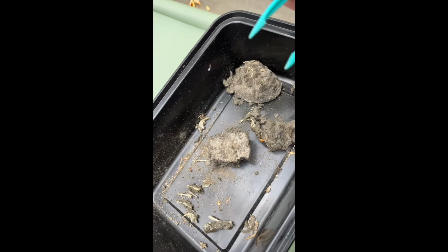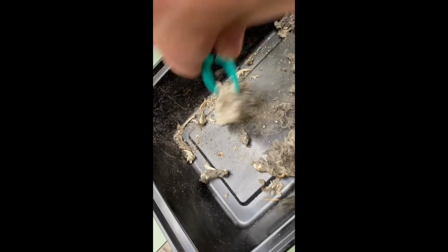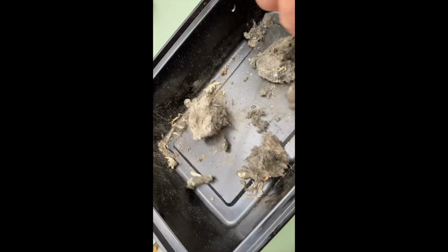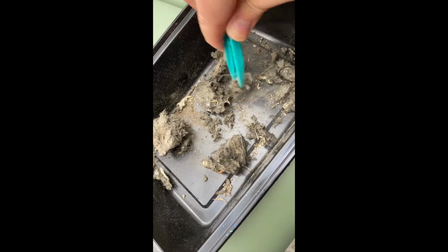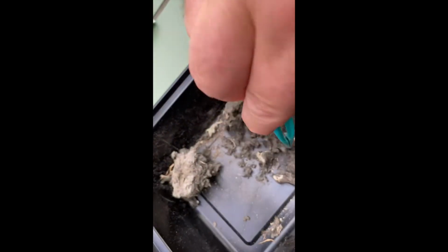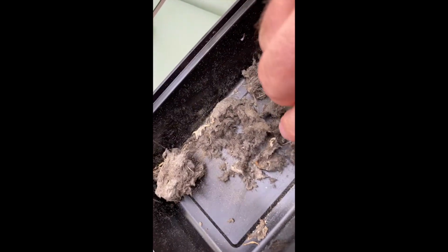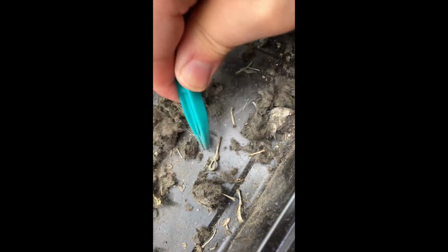Can I have a shot at it? Difficult. It's kind of compacted in there. Piece here. It's like another, maybe part of the jaw. This is an older pellet, so it's not a fresh pellet. That's why it's a little difficult. Usually, quite sure what that is, but could be a pelvic bone.